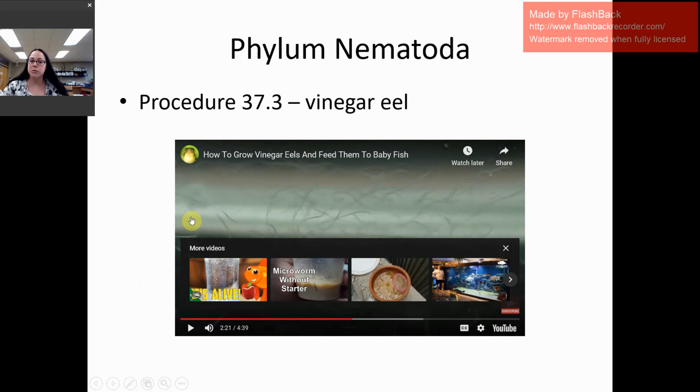So those are extremely small worms. They are maybe 3/8 of an inch, just pretty small worms. Okay. Through a coffee filter.